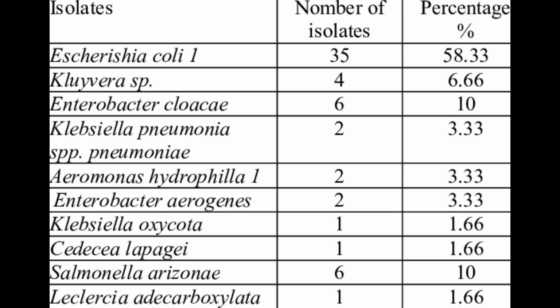Okay, let's start with our own. Purple over purple, where the LDC is positive. An example is Klebsiella. Initially it is yellow because of glucose fermentation, which then turns to purple because of cadaverine, LDC positive. If the deaminase is positive, an example is Proteus, which is positive to glucose and remains yellow, because it is not LDC, it deaminates, giving a red slant.